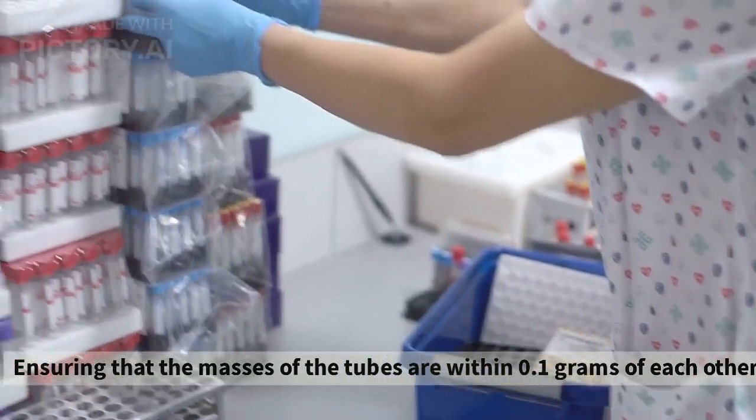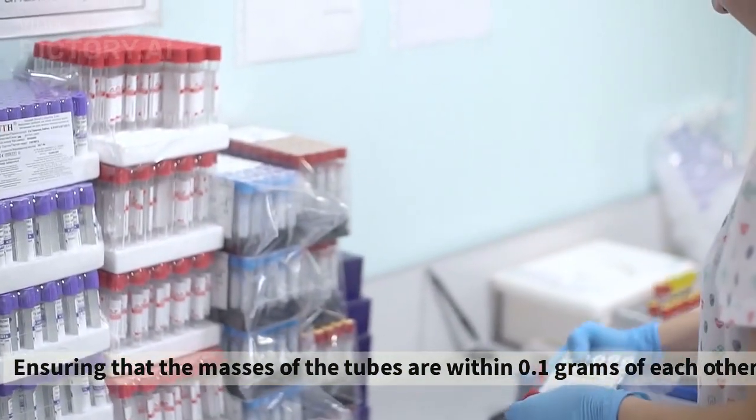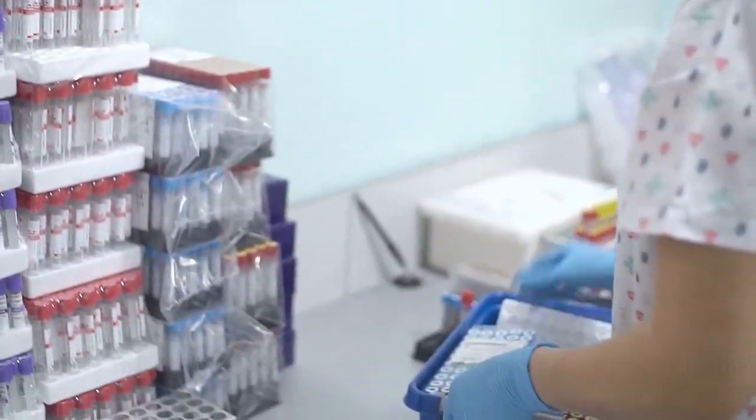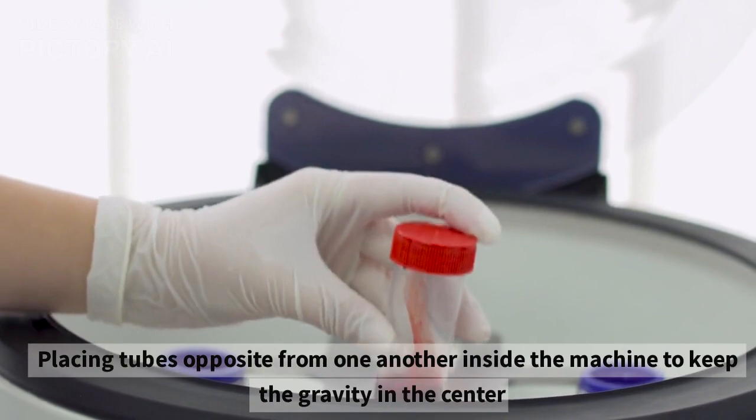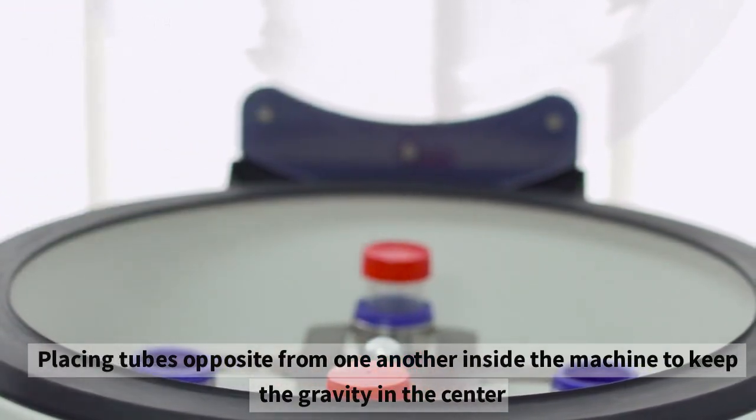Ensure that the masses of the tubes are within 0.1 grams of each other. Place tubes opposite from one another inside the machine to keep the gravity in the center.